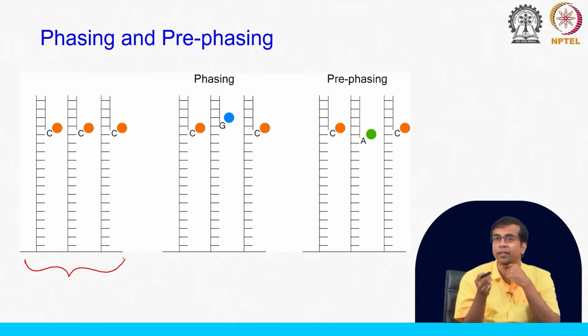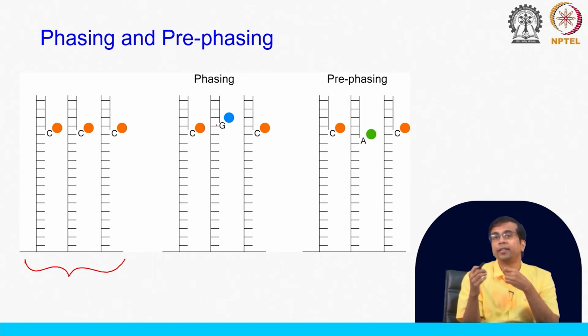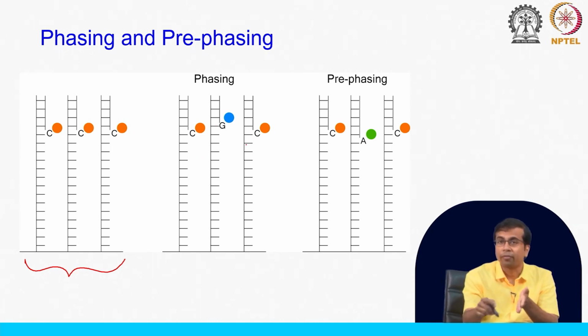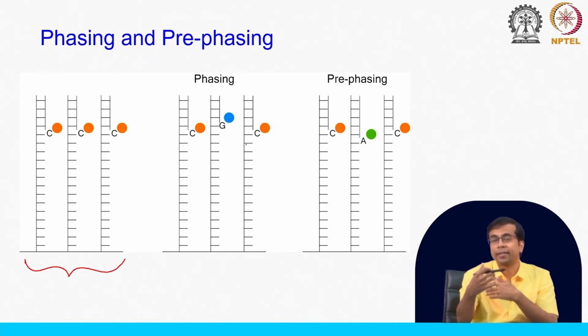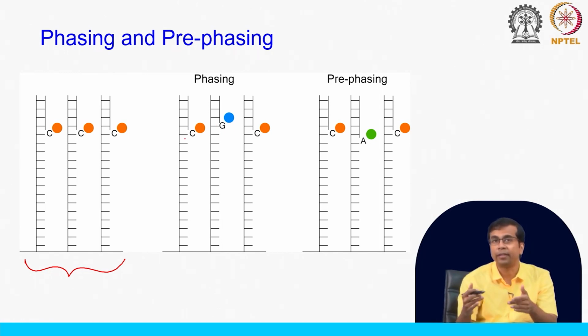The fluorescence tag does not wash away in one strand perhaps, and it stays back. What it means is that it is read twice, it will read the G twice, and then it will go out of phase. In the next cycle it will then do the C when the other strands have moved on to the next one, so it will lag behind the other strands.